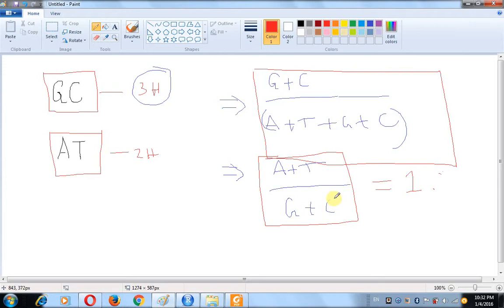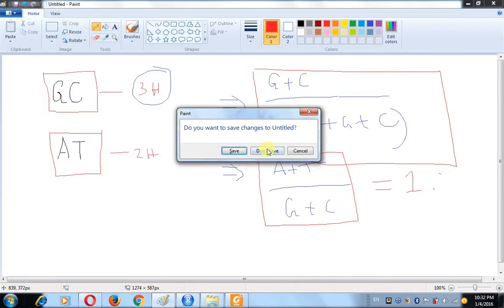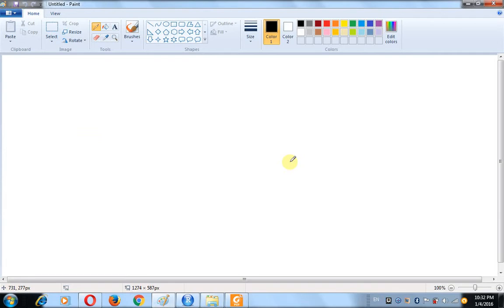So now in R, what happens, we try to find it. We have pretty clear methods in R. First, what we have to do is import the data set. I already told you how to download the data set from the genome banks.